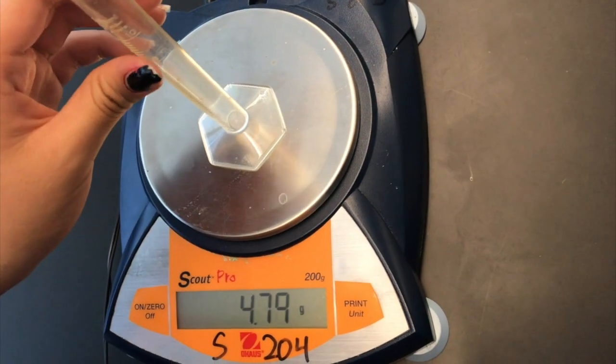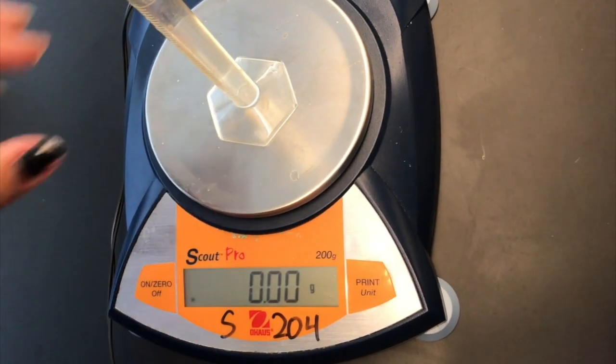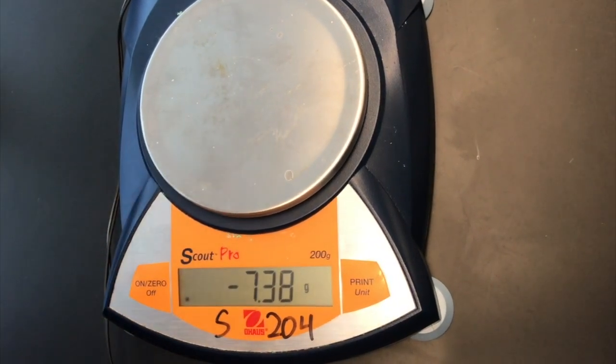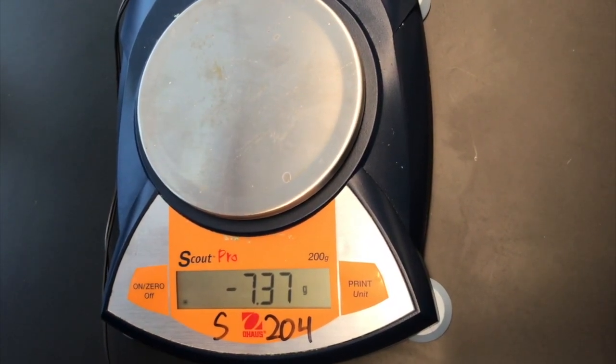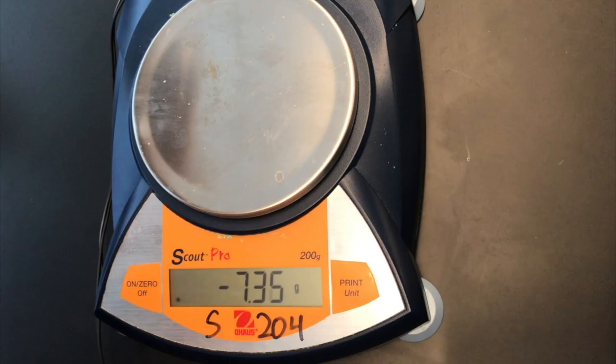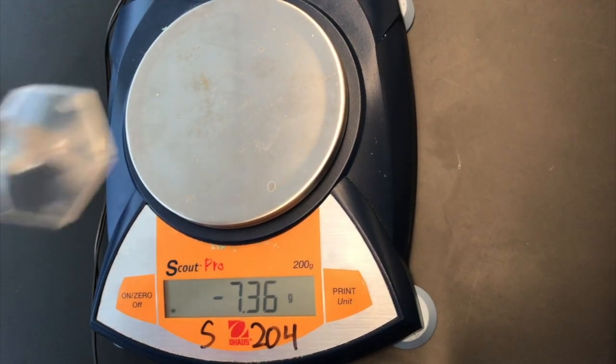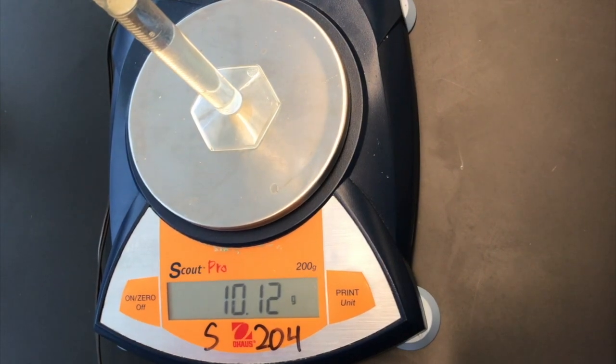To obtain the density of a liquid, the measurements of both the mass and volume are needed. In this case, the liquid substance will be water. First, tare a small graduated cylinder on the laboratory balance. Then, measure out 10 milliliters of water into a small graduated cylinder. Be sure to record the measurements correctly by reading the bottom of the meniscus. Place the graduated cylinder containing the water onto the balance and record the numbers.